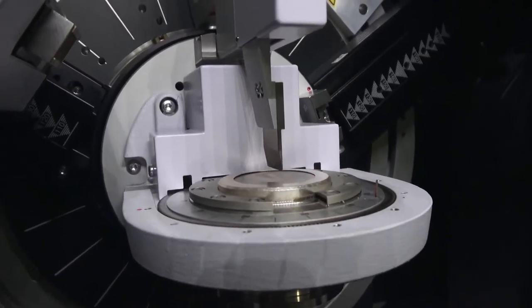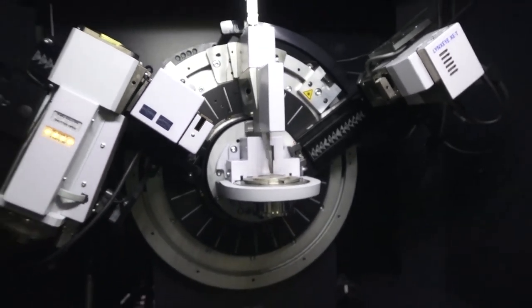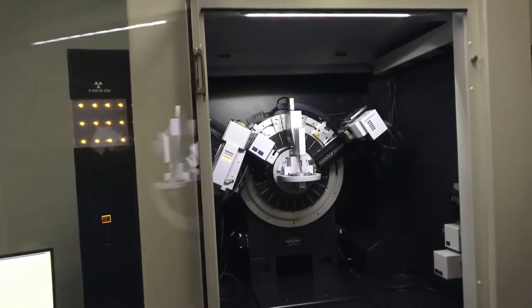So maybe we'll take a little look at that and how you would actually set up one of these dynamic beam optimization scans. Yeah, so let's take a look at the software and we'll set up one of these scans.